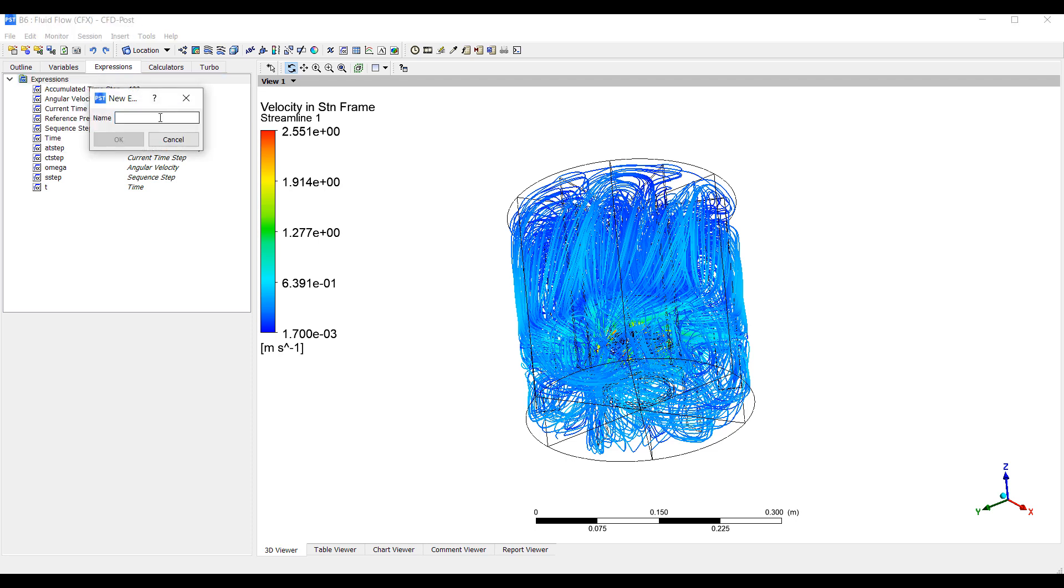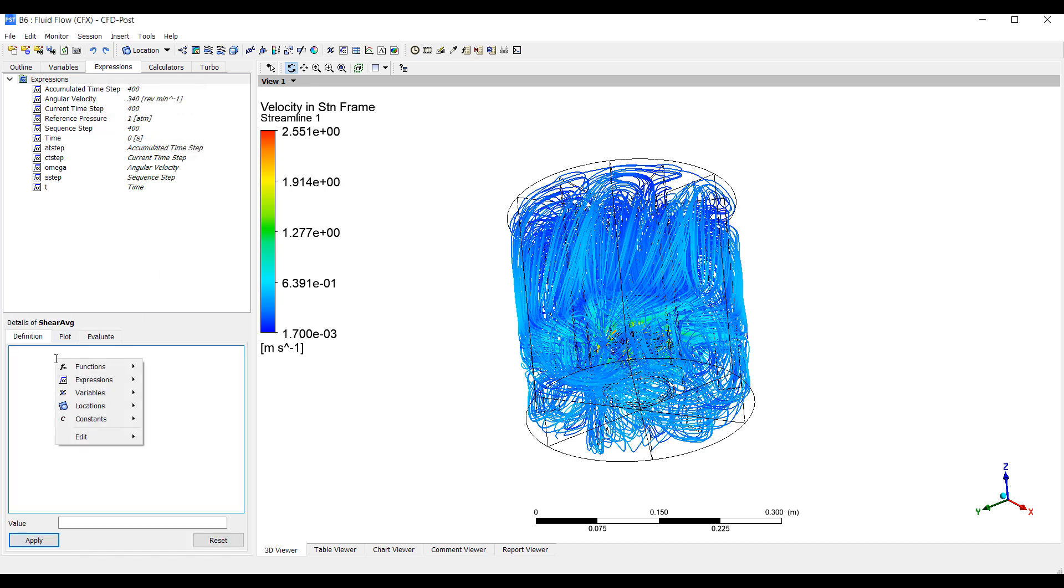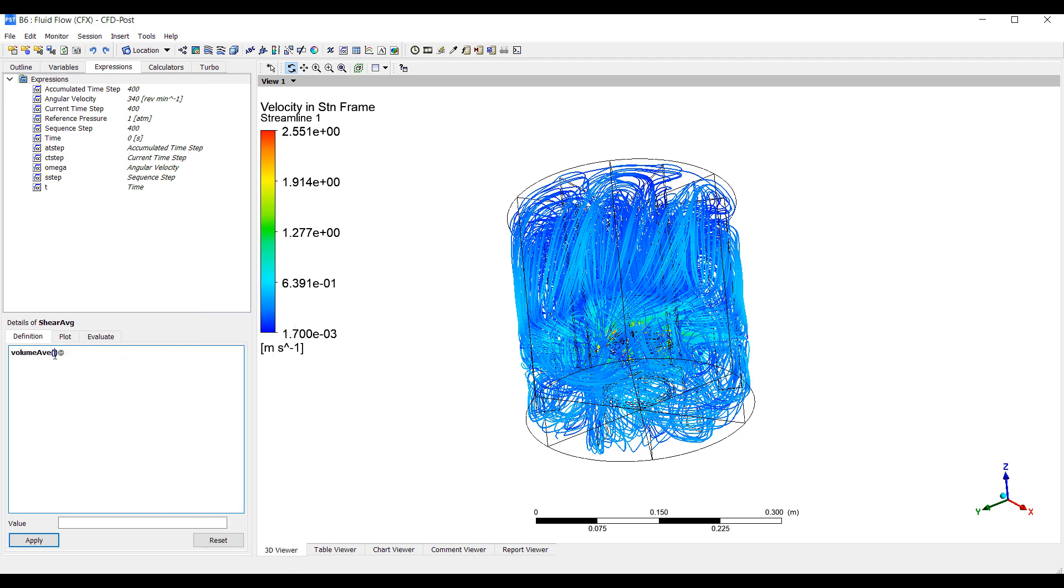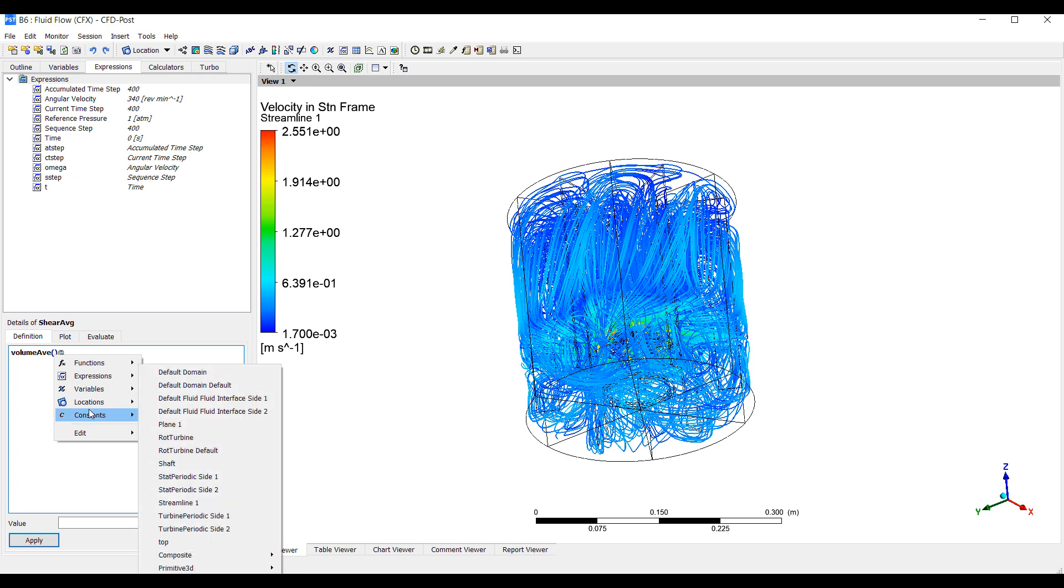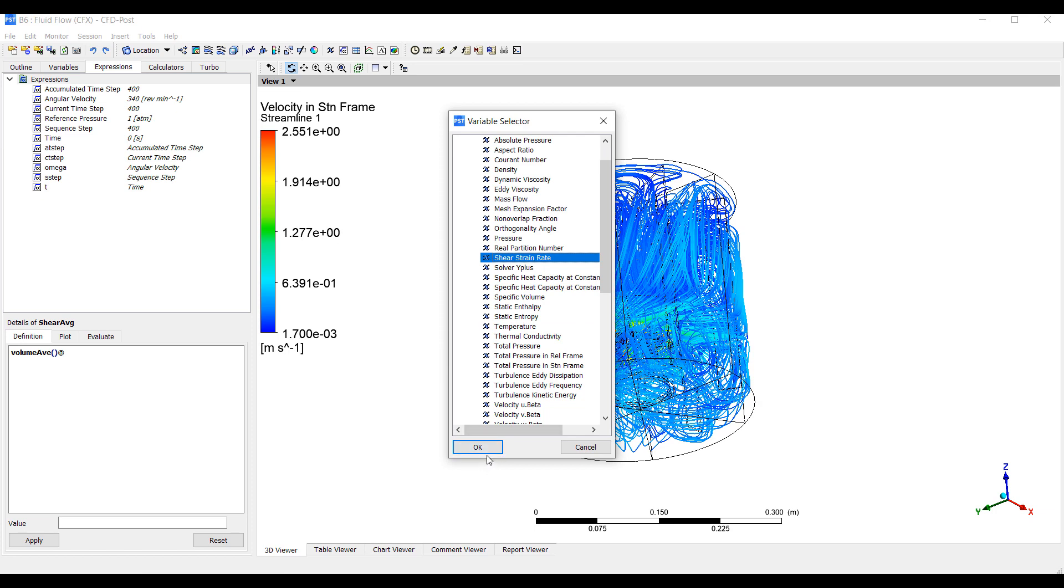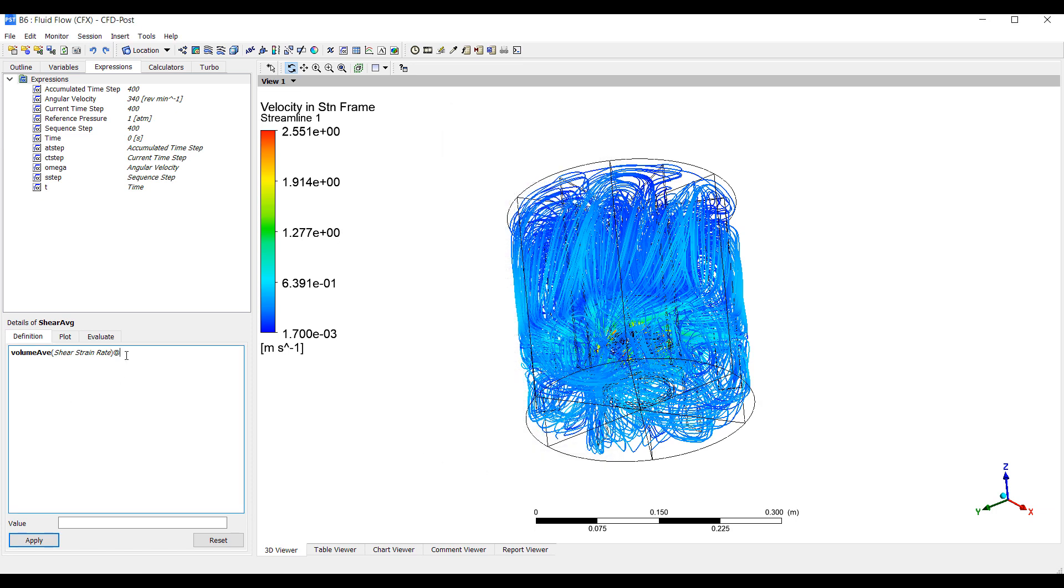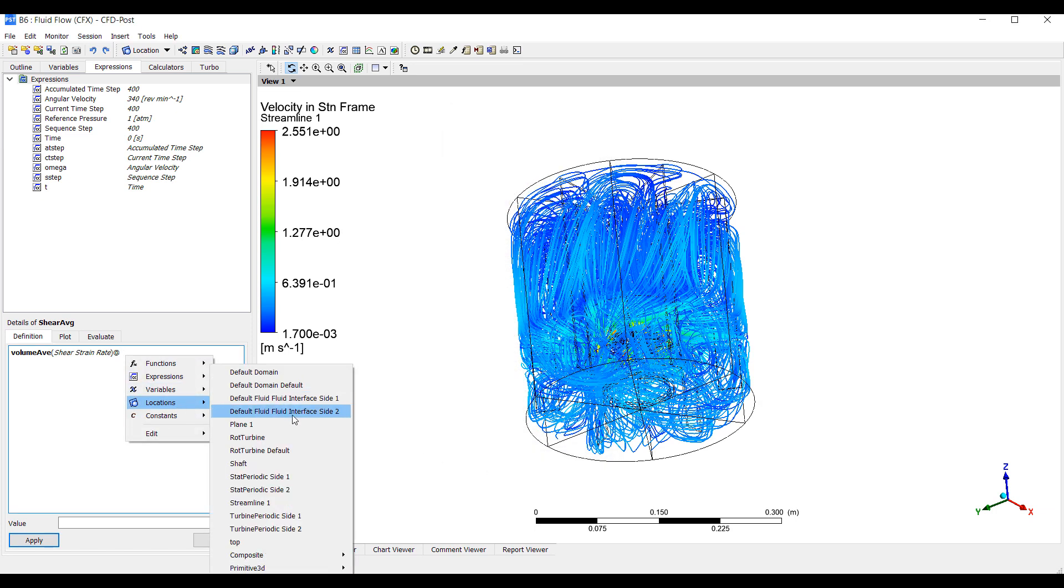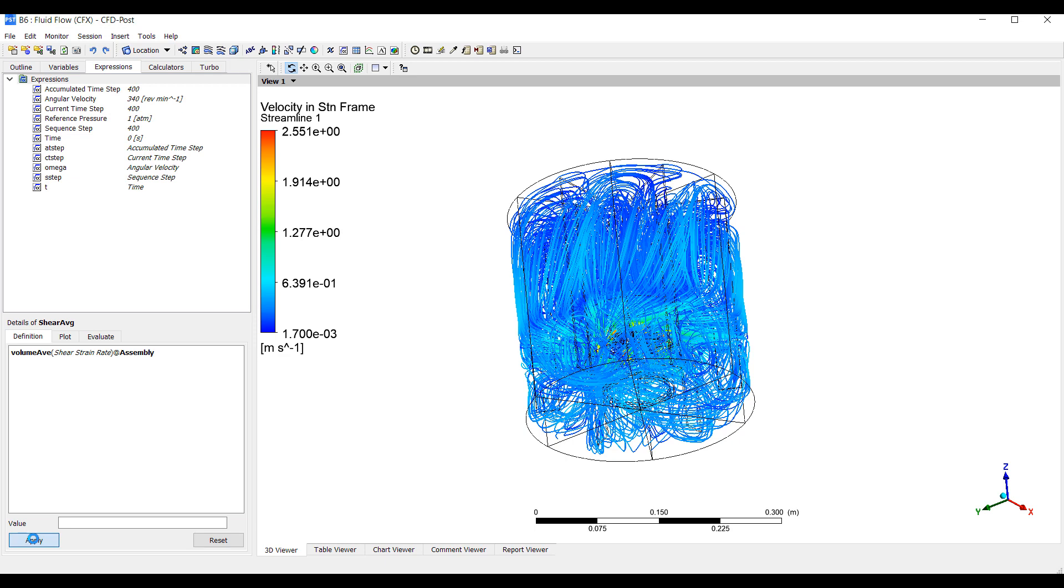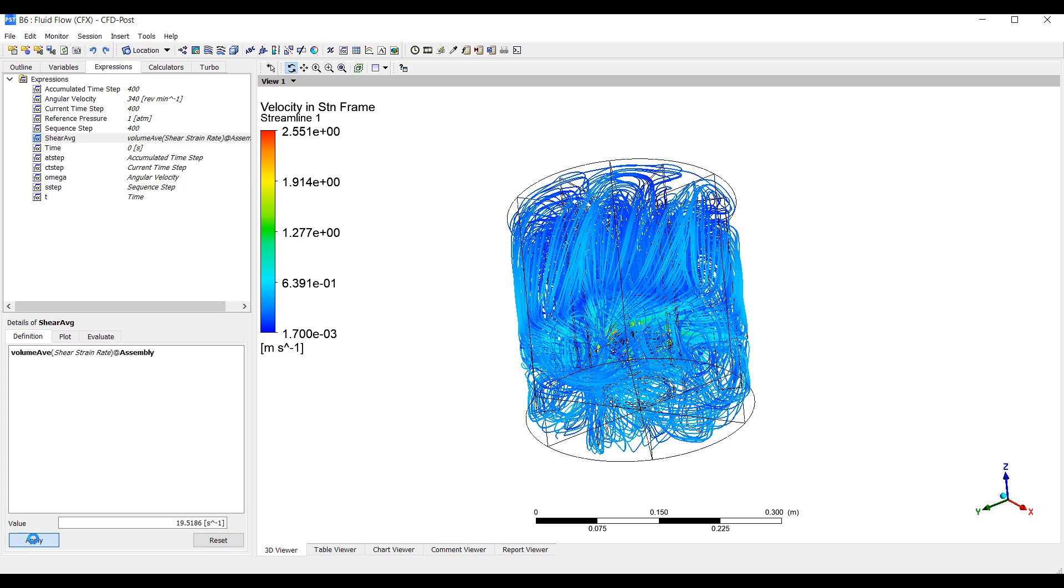We can also use some expressions to calculate averages. So one of the things we can do is one of the things that's very useful to know in this case is things like average velocity of the flow as well as average shear rate. So we're going to calculate the shear average. And this is pretty easy to use because you can right click and get all the expressions. So we're going to get the volumetric average of shear, shear strain rate at location. You can pick from any of these locations or the whole assembly. So the average shear is about 19.5 shear strain rate.